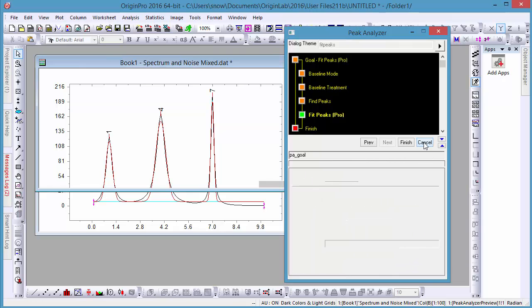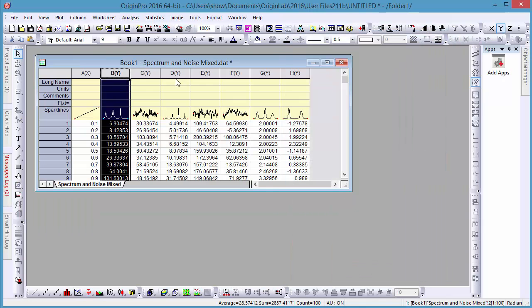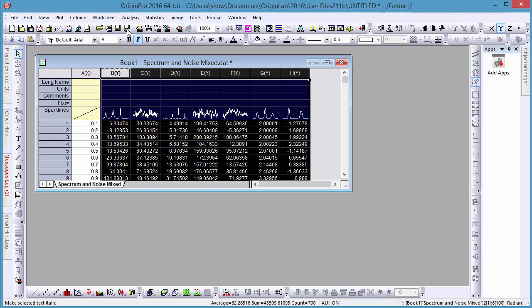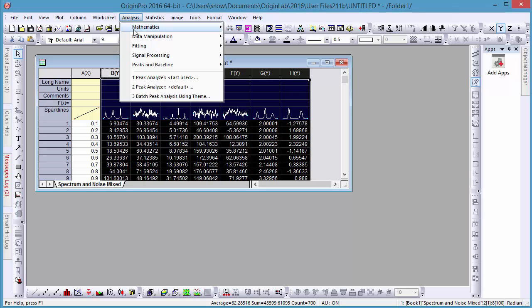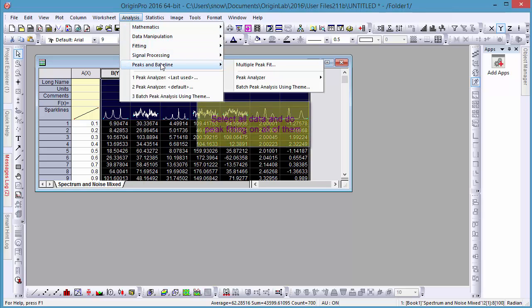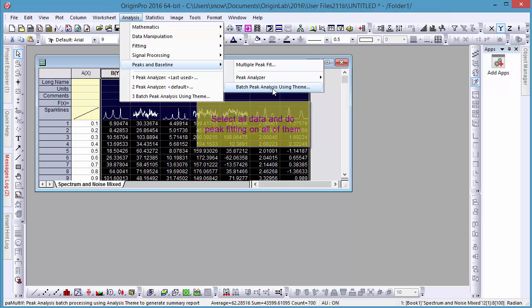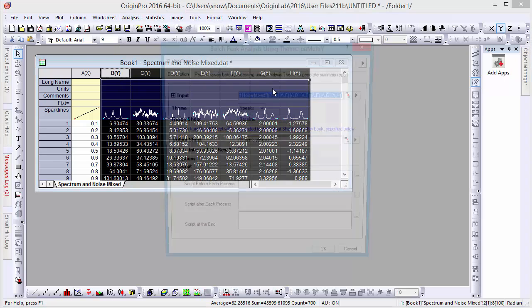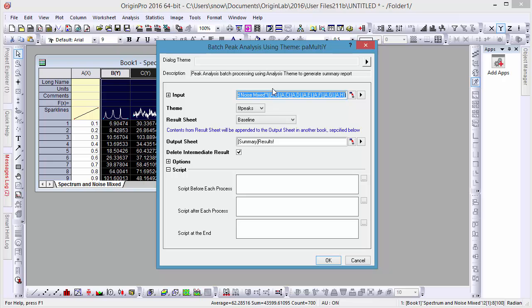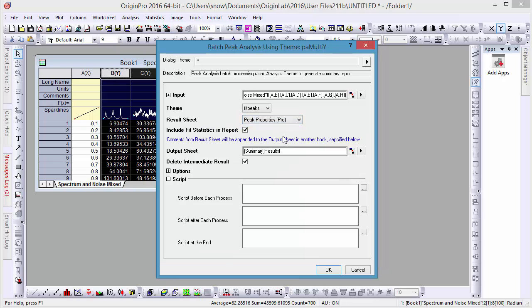Now click Cancel to close out of our Peak Fitting dialog box, and let's select all of our data to run this analysis. Let's go to Analysis, Peaks and Baseline, and select Batch Peak Analysis using Theme. Unless we have any other previous themes saved, the default should be the one we just created. Then change the result sheet from Baseline to Peak Properties.